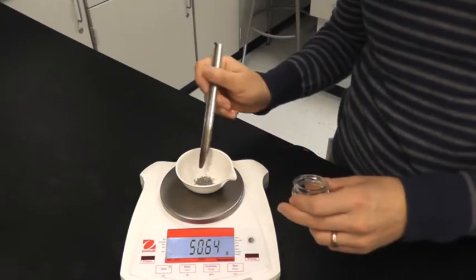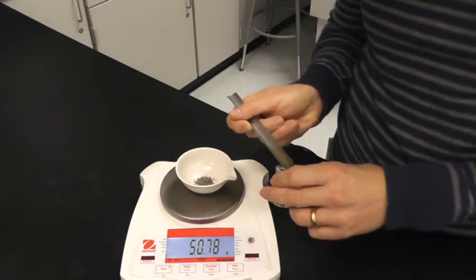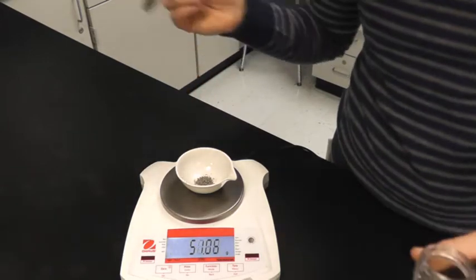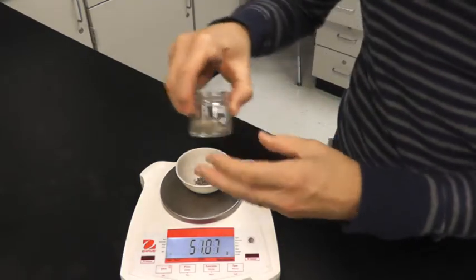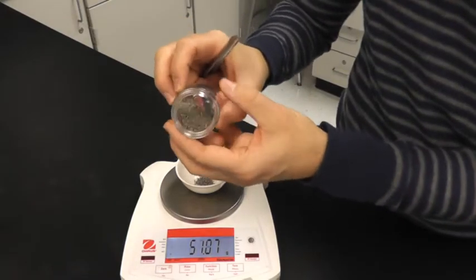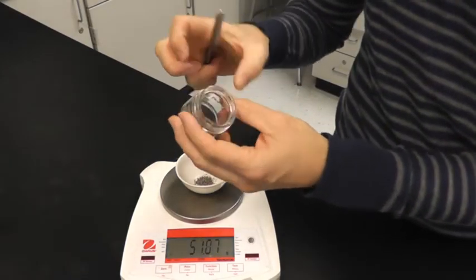So I want about 2 grams of tin. A little bit more. There we go. That's pretty close to 51. So 1.9, whatever. This is granulated tin. So it's tin that's just been run through a machine that ground it up into really, really fine pieces of tin. All right?